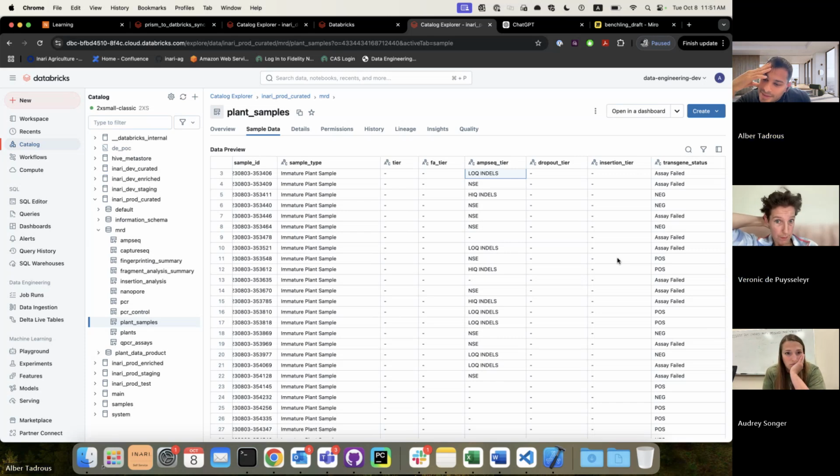Well, I would be hesitant. We are not there yet. What we need to do is we are now reworking the AMP-seq pipeline so that as part of the pipeline, we can give allele information and we can do this kind of binning, but we don't have the code. So if we do it now, people will just fill out anything and I wouldn't do it. We don't have the information.